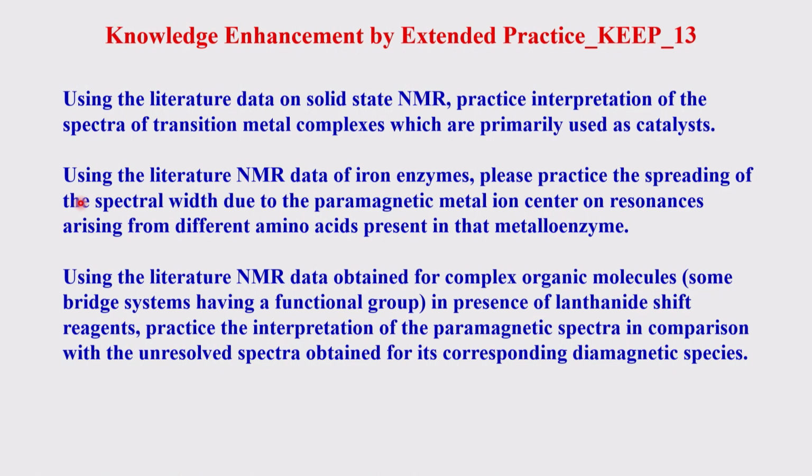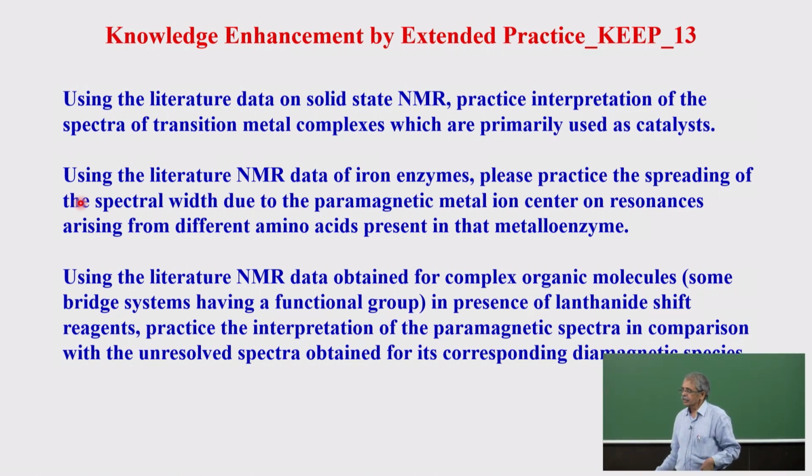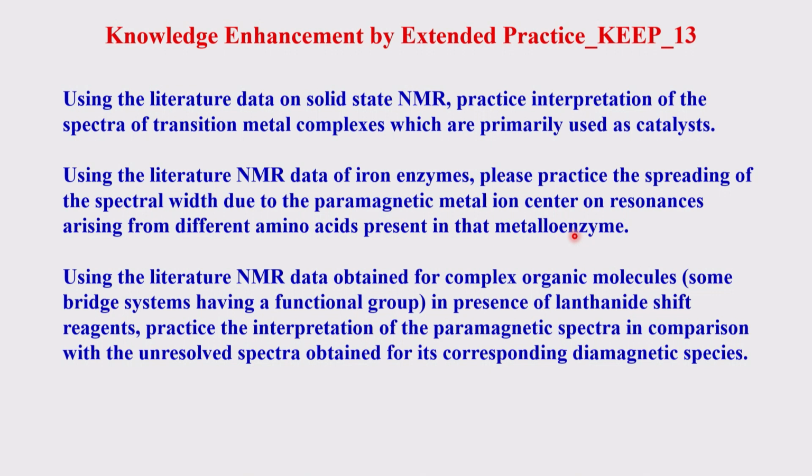As usual in every lecture, every topic, at the end I give the practice session. Here also I draw your attention to the knowledge enhancement by extended practice. So I have already shown you the solid state NMR, and try to take NMR literature data and start interpreting for different transition metal complexes, which I have not shown much. So you can take the data that is available and try to understand how the interpretations are going. Similarly, you can take some iron enzymes and look at their NMR, how this paramagnetic NMR is influencing, study that.